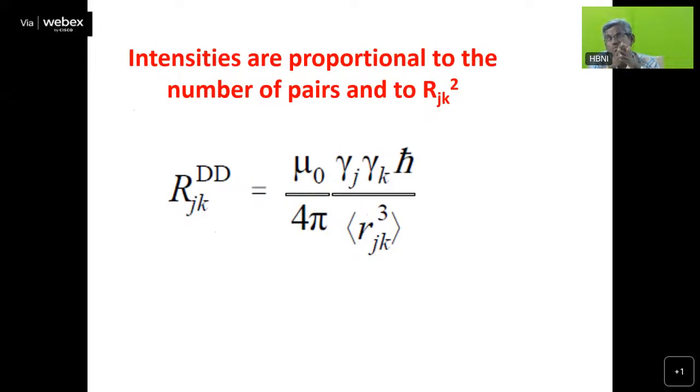So normally when people do solid state NMR, there is a person who theoretically also predicts, okay, this type of structural configurations are possible, energetically feasible. So then they correlate their results with the experimentally observed pattern. So both theory and experiment go hand in hand. Of course, simple things we can predict, a Q1, Q2 stage, what is the type of structural unit present, etc. But if you want to evaluate the distance between the atoms or distance between the groups, etc., you need to have some sort of a simulation program also along with this.